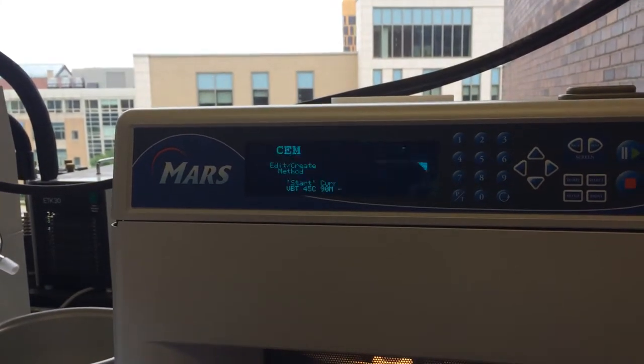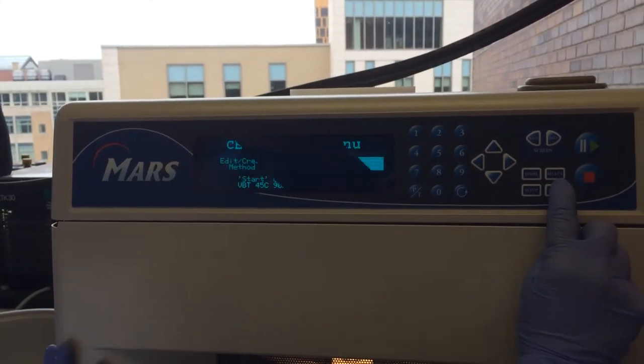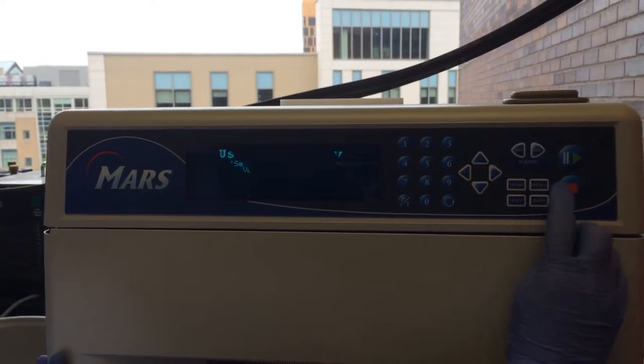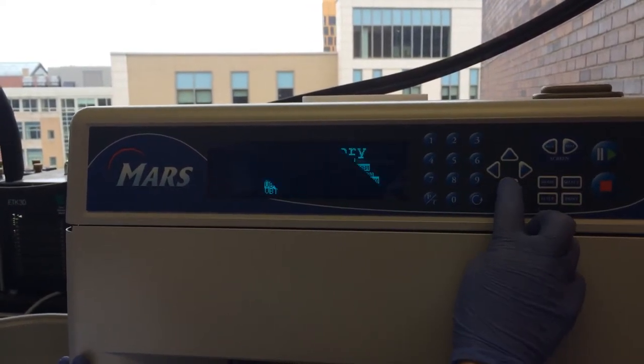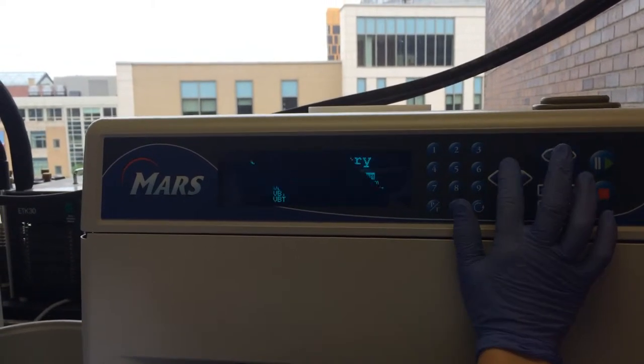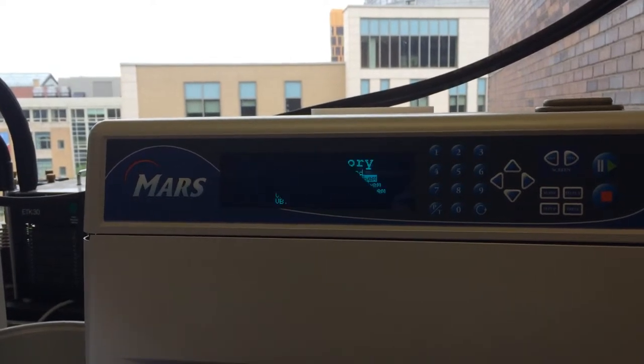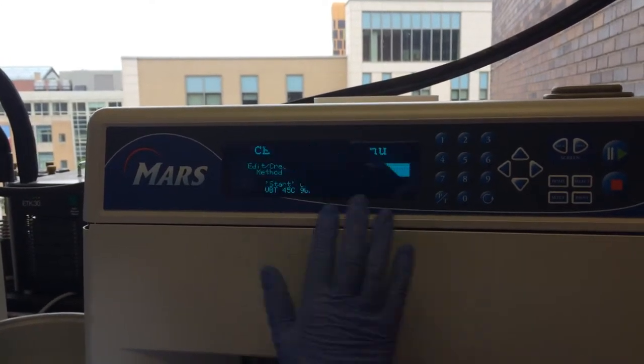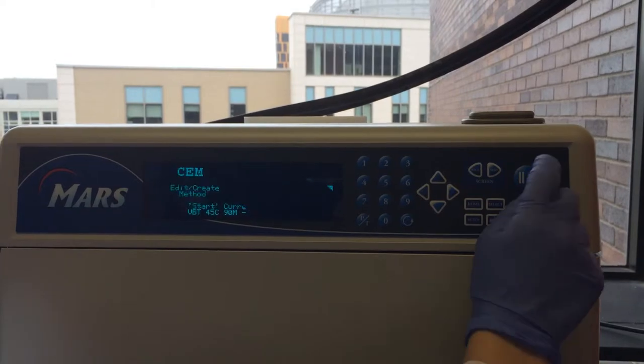In order to select a method, we have to go to load method. And you press this button here, select. User directory, select. And then you can use the up and down arrows to scroll through and choose a method. We are going to select 45 degrees Celsius at 90 minutes. And then you press select. And then when you get back to this screen, all you have to do is press the green triangle for play.